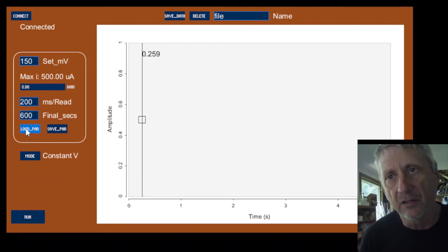We can load a new parameter set or save this parameter set and once you know the values you want to have, then you'll want to save the parameter set and use it in the future. So this is all for a constant voltage experiment. We also have a testing experiment, which is going to be the sawtooth.